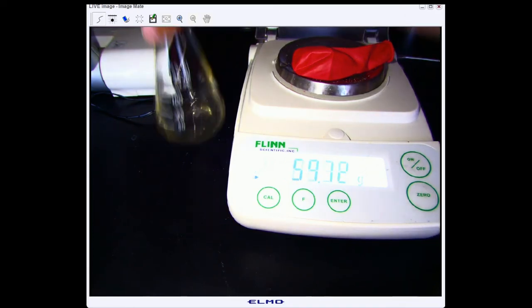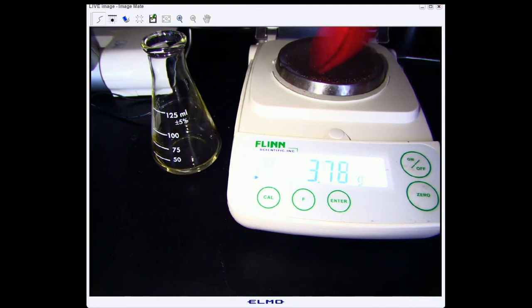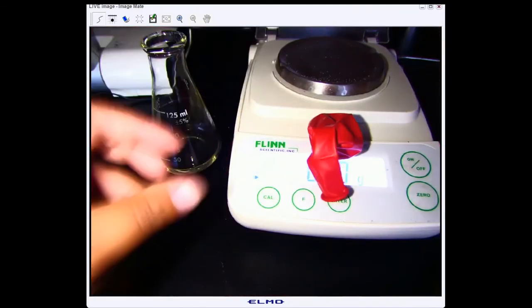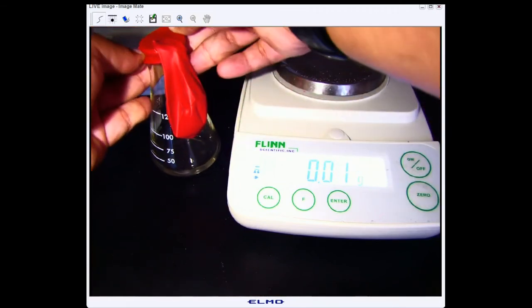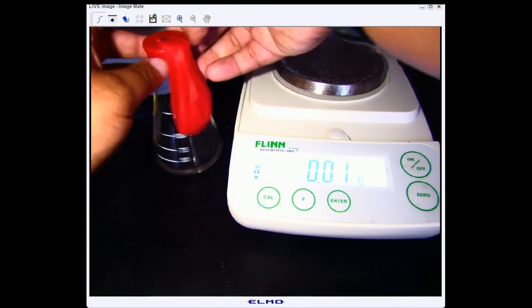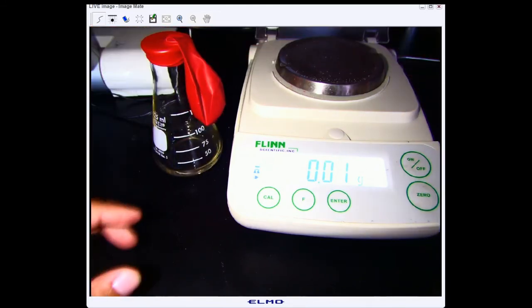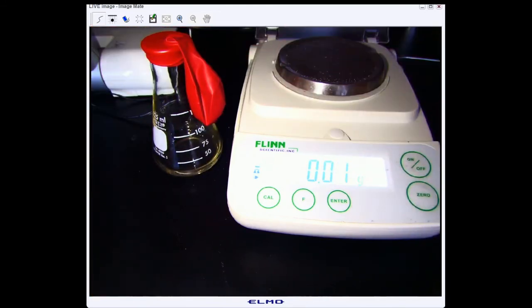So we're going to take our containers off of the balance. I'm going to make sure that all of my baking soda is down in the balloon, and carefully stretch that over the mouth of the flask. Then we're going to cause the reaction to occur on the balance.